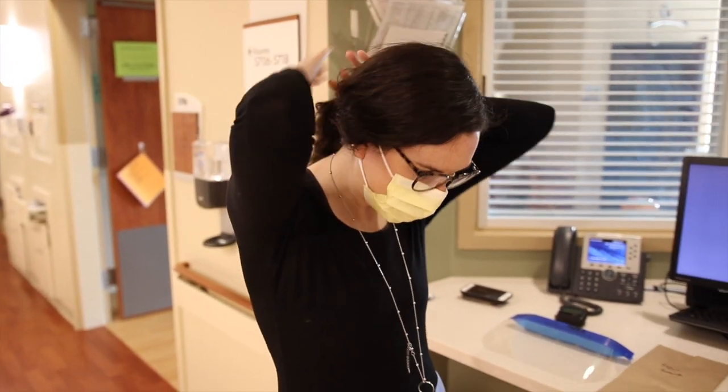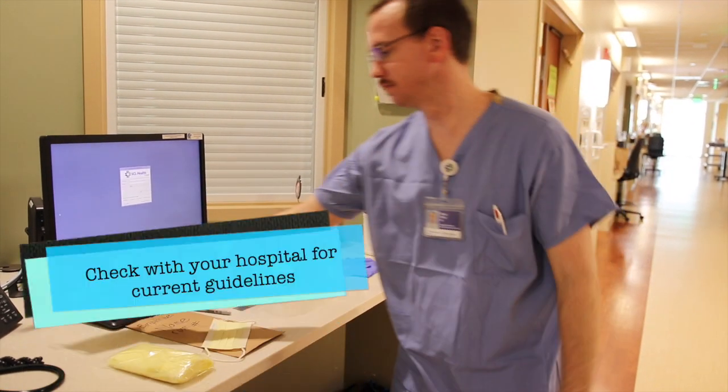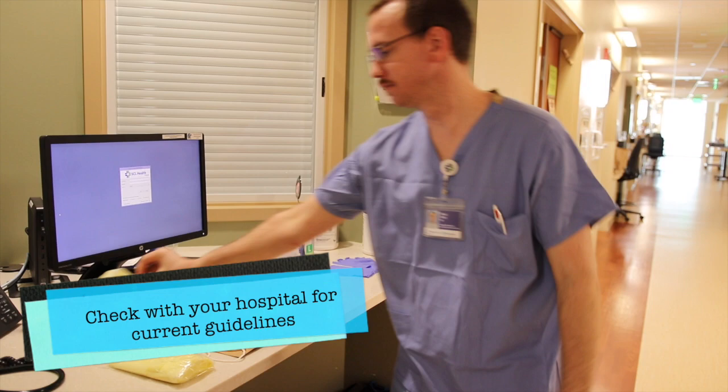If you have long hair, please ensure that it is secure. If your hospital is currently changing masks before entering the room, please do this at this time. If not, please retain your current mask. Check with your hospital for current guidelines.